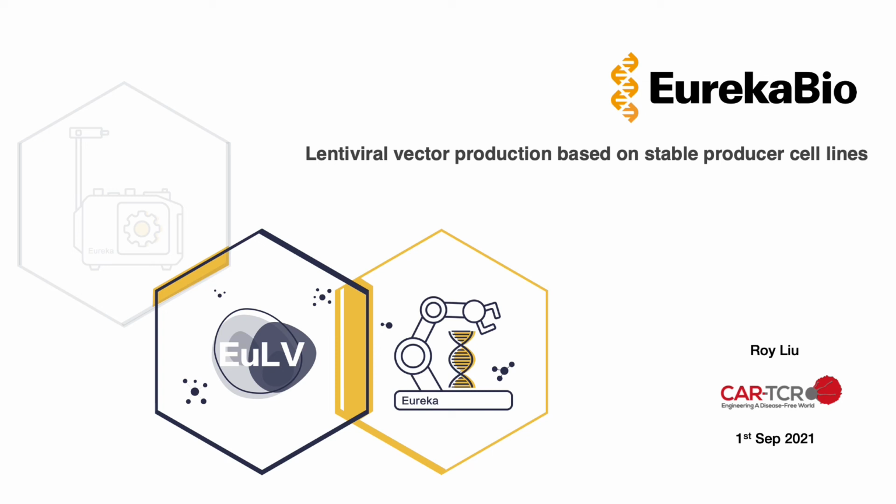Today I'm going to give you a presentation on lentiviral vector production based on the stable producer cell lines.